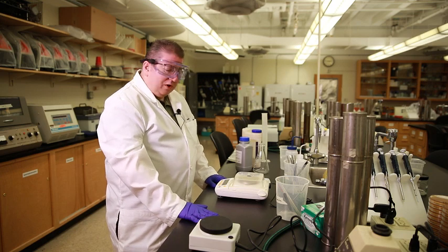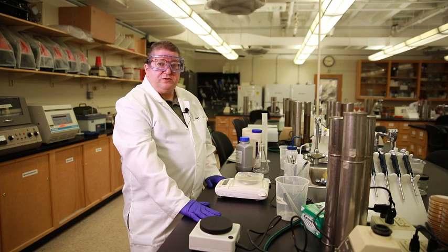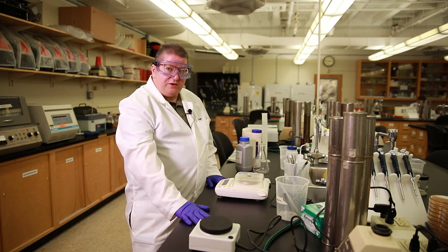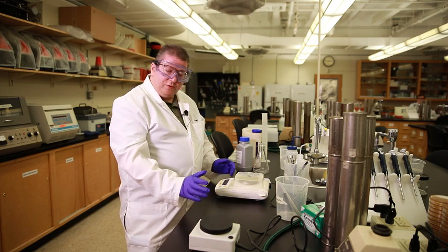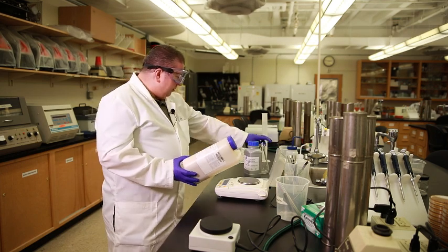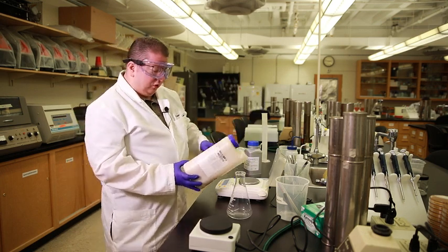All right, so today we're going to be making nutrient agar plates. In Biology 439, students must do an independent research project, and so a student has requested nutrient agar plates for their project. So we're going to go ahead and make those today. Now, we're only going to be making 250 milliliters, so we're going to be using this 500 milliliter Erlenmeyer flask to do that.